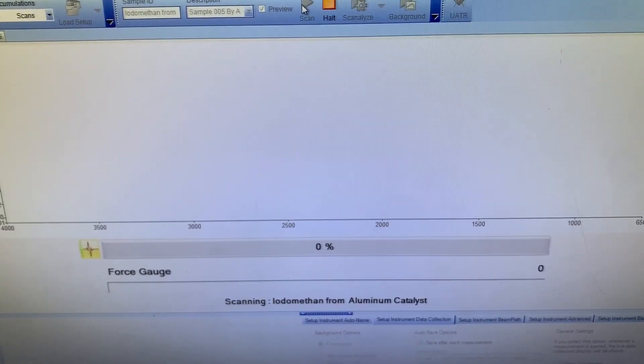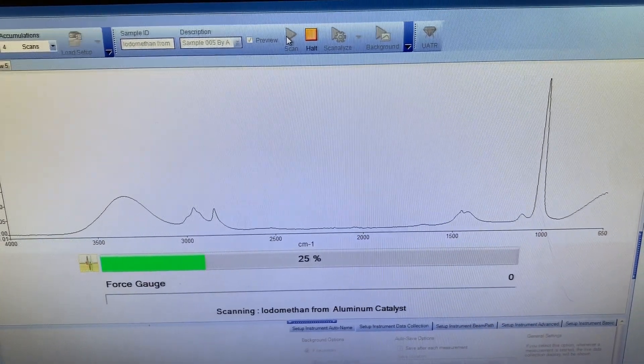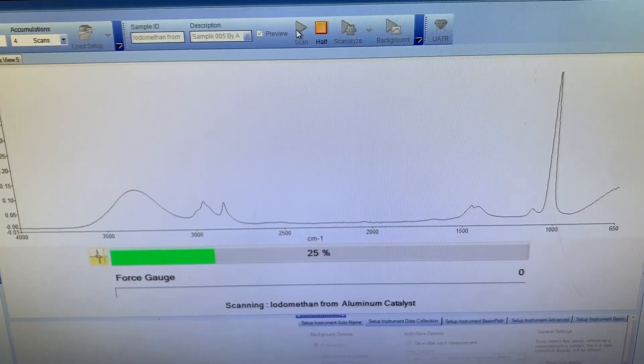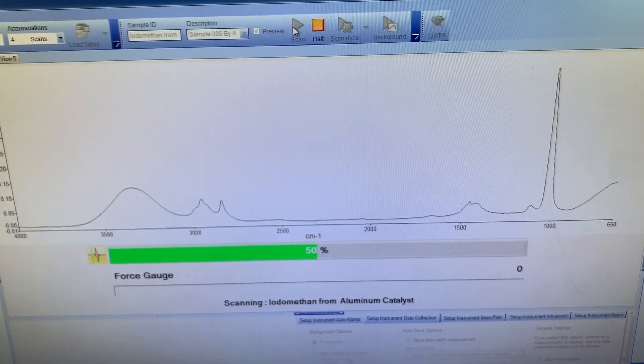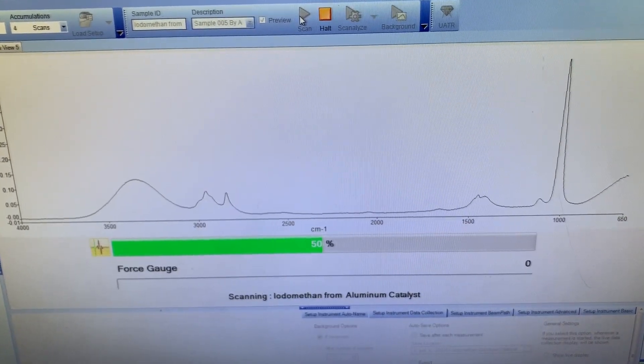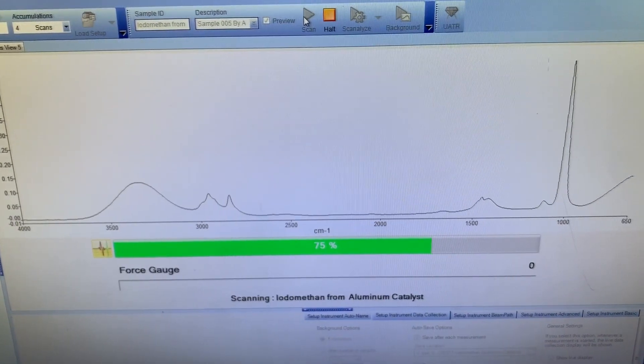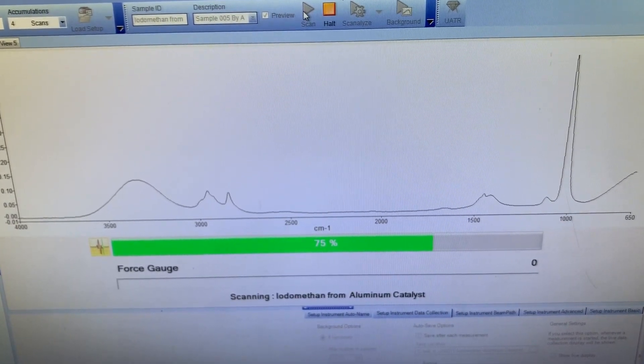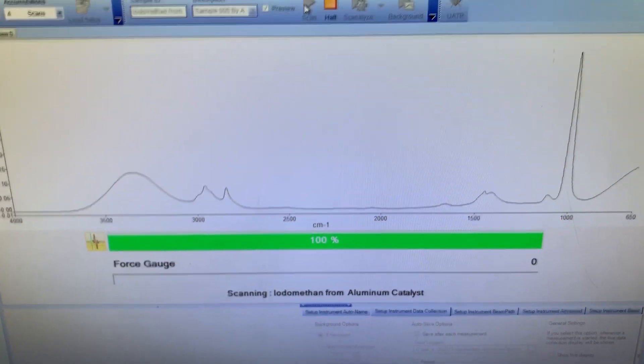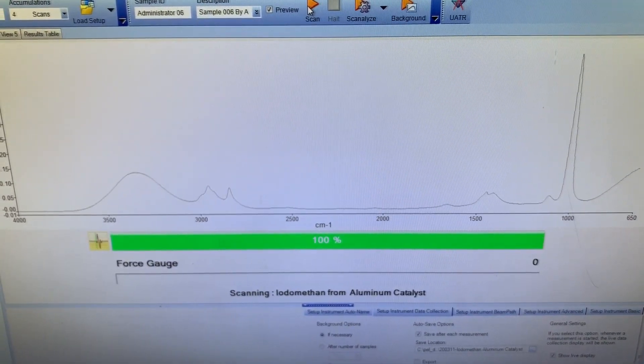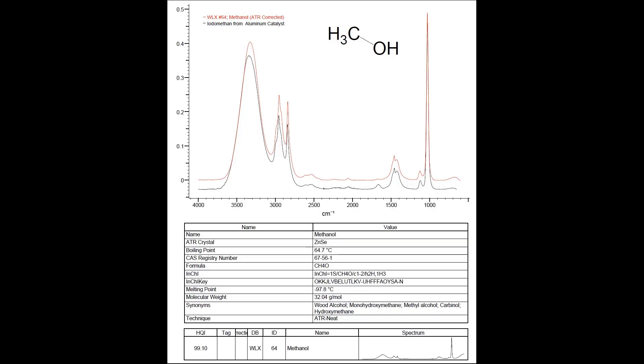FTIR is not the most sensitive analysis that can be done, but it's quick and fairly effective at identifying materials. Once complete, I can search against the database. What this tells me is that my distillate is mainly comprised of methanol, which is the entire reason why I went through the aqueous wash prior.